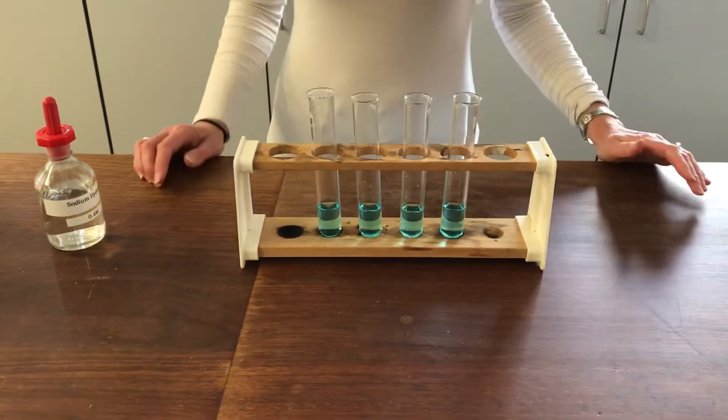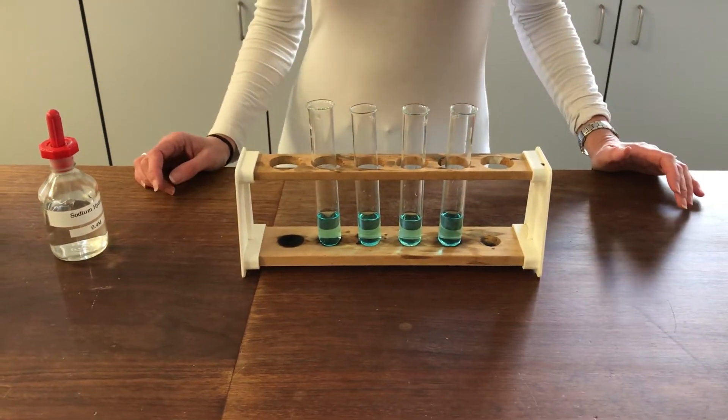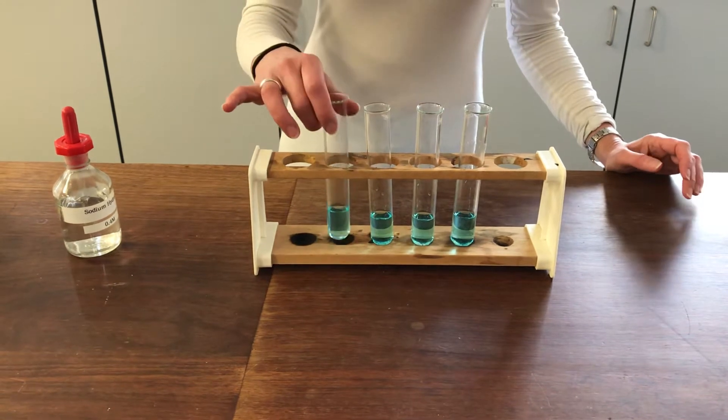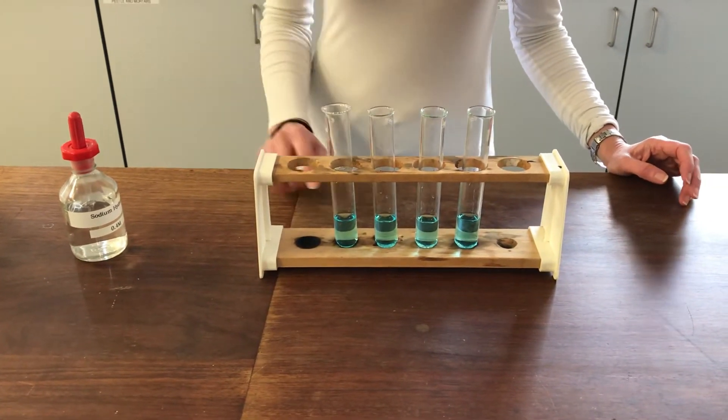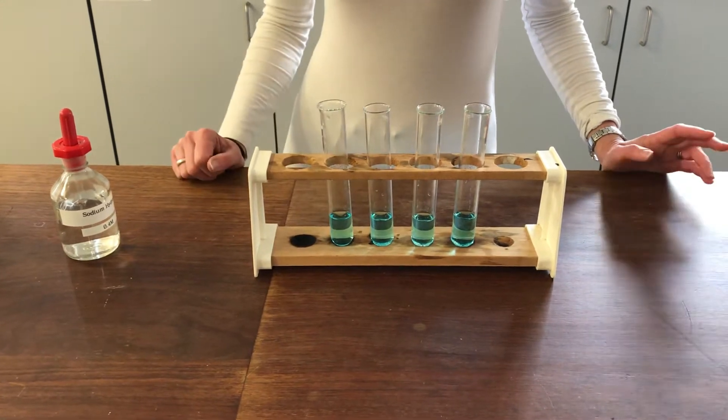I'm going to have a look at some colours of some copper complexes. At the moment I've got some copper sulphate solution in these boiling tubes and it's got a water ligand around it which is giving us this blue colour.